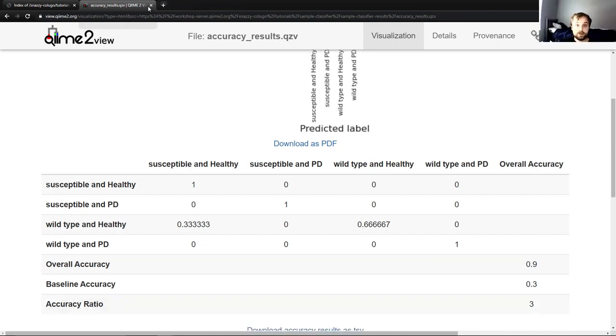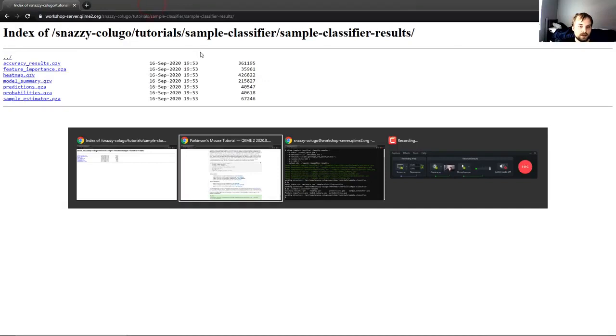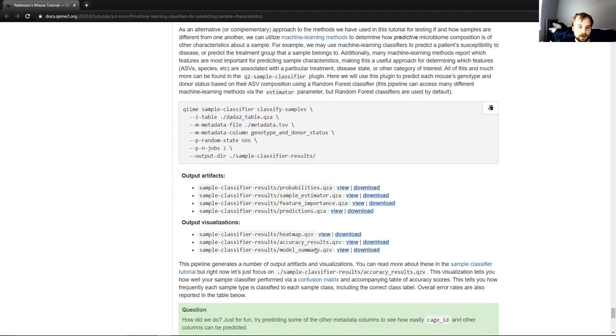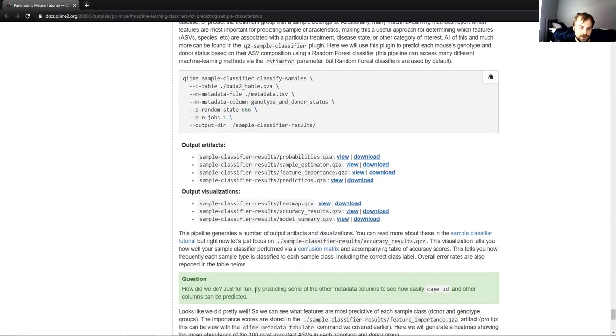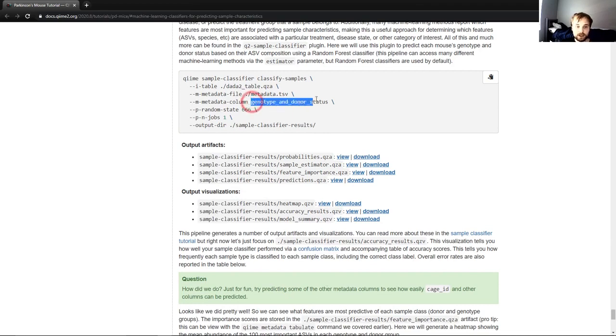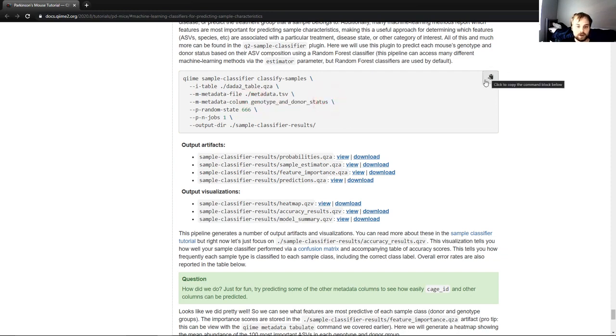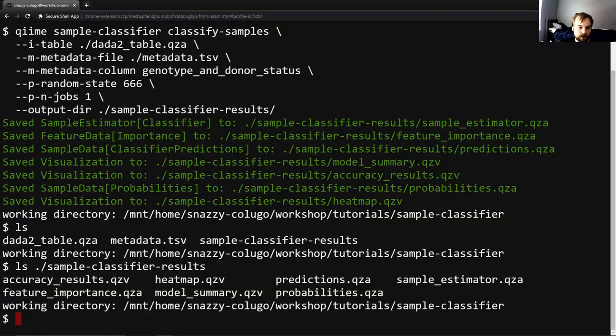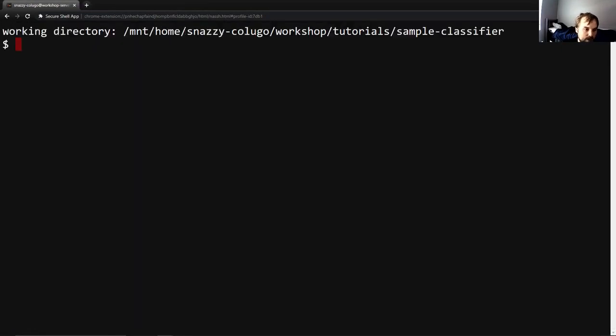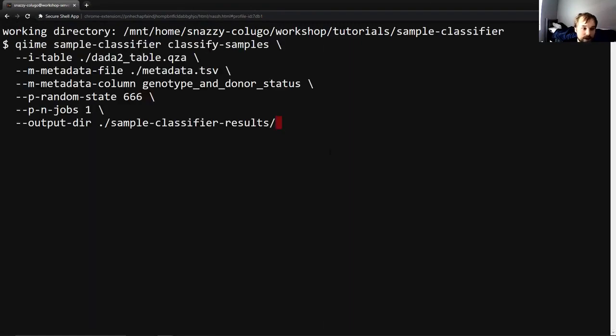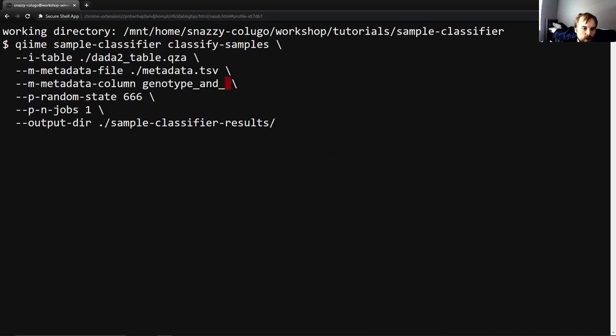Now there's a follow-up question on this as well that says, just for fun, try predicting some of the other metadata columns to see how easily cage ID and other columns can be predicted. So we did pretty well at predicting genotype and donor status. Let's try doing it with cage ID. So in order to do that, I'm going to go back to our terminal. I'm going to clear this because it's getting a bit messy. I'm going to press the up arrow until we get back to the command that we entered previously. And for metadata column, instead of genotype and donor status, we are going to try to predict cage ID.